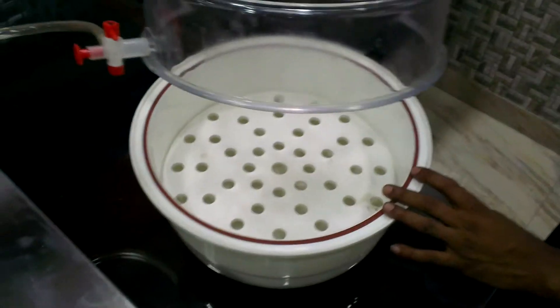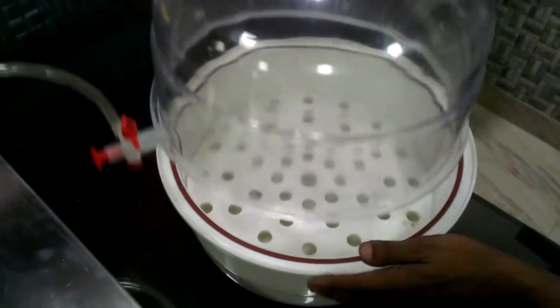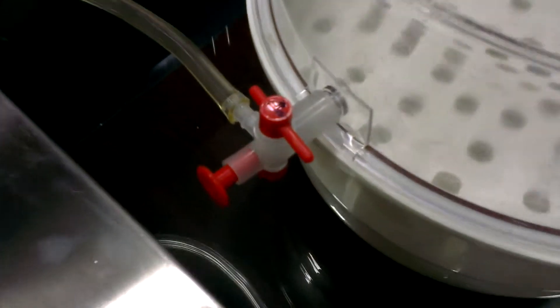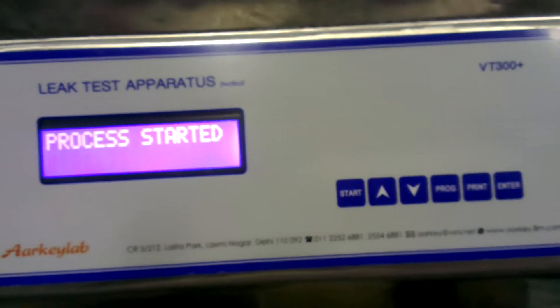Clean the desiccator top and close the lid — place the lid so it is in the correct position. Now press Enter to start.